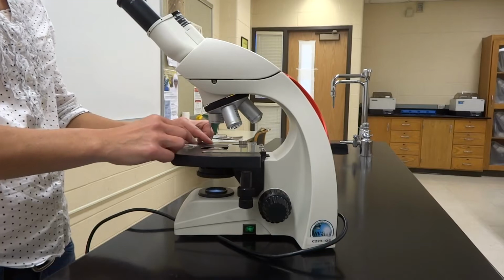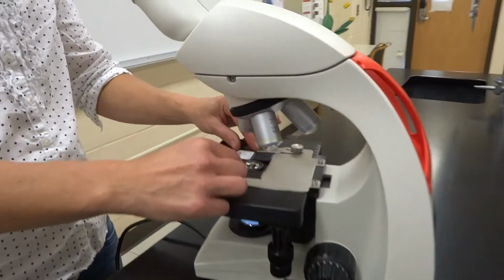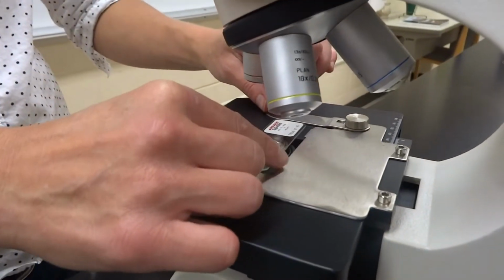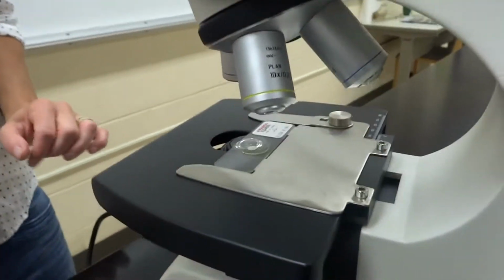So now you're going to mount the slide. When you mount the slide, I'm going to zoom in. You're going to find your stage clip over there, the metal piece, and it'll click. And if you're like me, you have fun doing this.